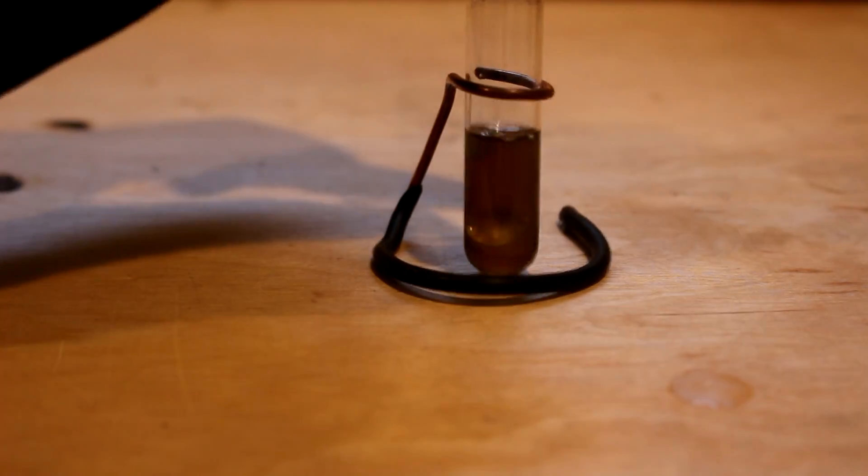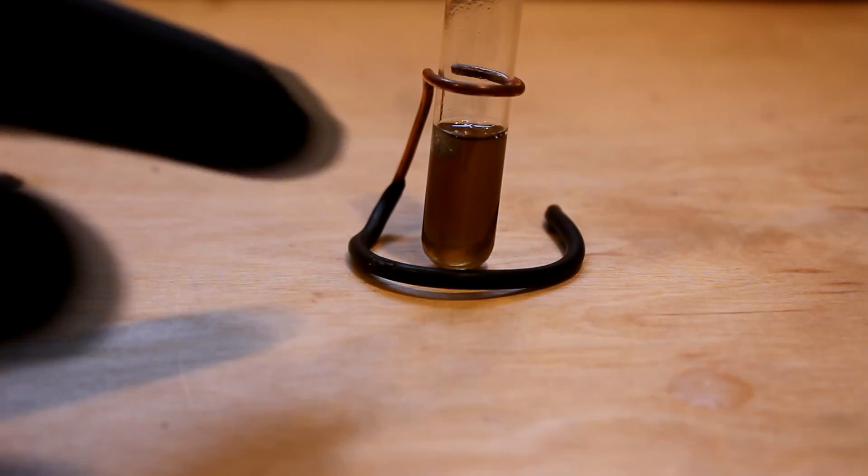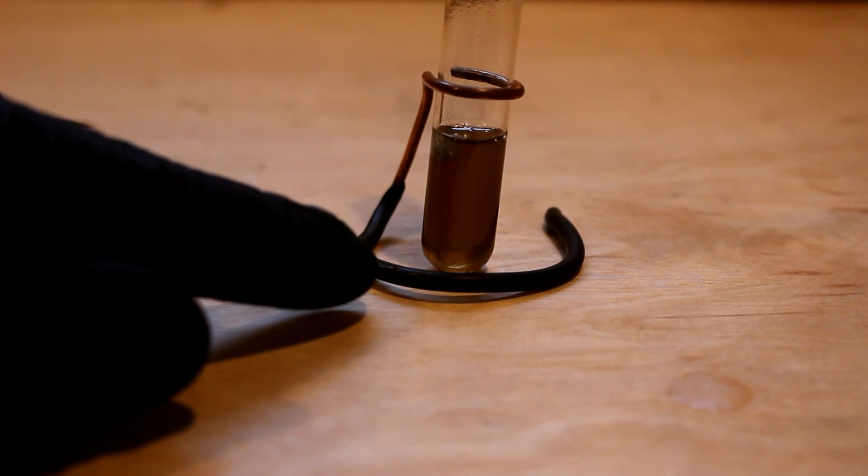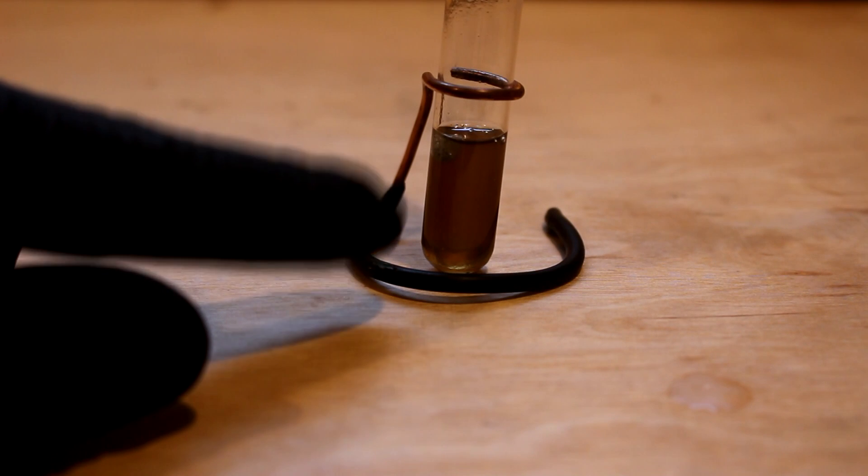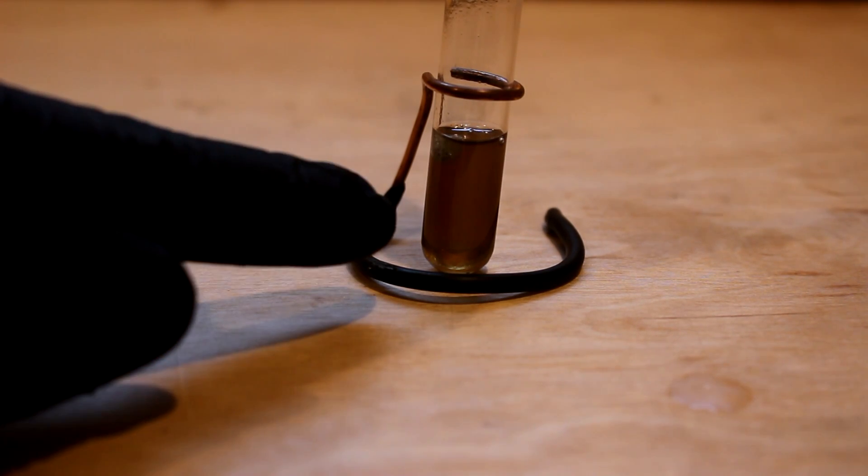Did it sink? It sank. There you go. Cubic zirconia has a density of around six grams per cubic centimeter. So it sank in the solution that is 4.25.